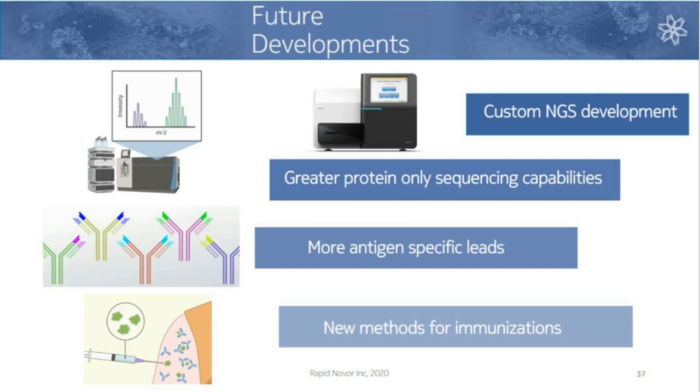And that is of particular interest to us as we continue to move forward, and this is why we're expanding in this area, because other people are asking us about other species as well, right? Like sheep, goat, llama, I get it. We want to work with those as well, and that's why we're developing those kinds of primer sets internally so that we can address those needs to our clients and hopefully for yourself as well.